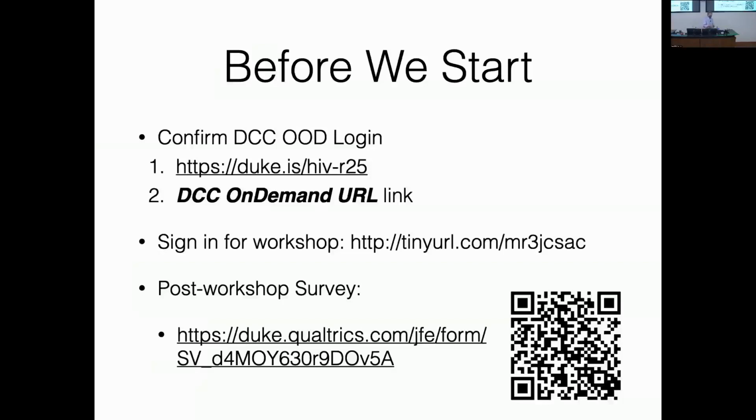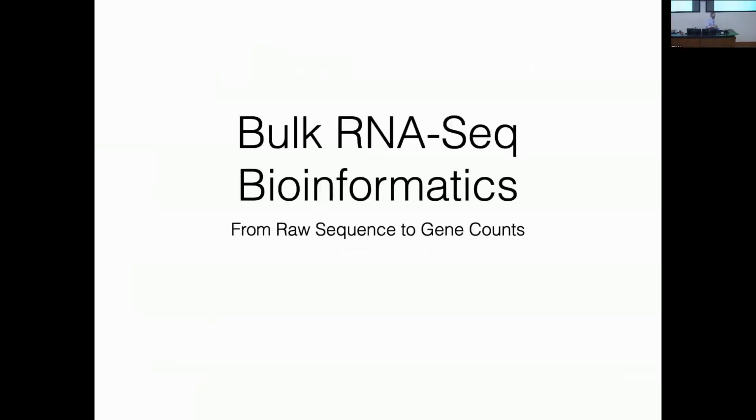Okay, so I'm here today to talk about bulk RNA-seq. If you're here to hear something else, then you're in the wrong place or at the wrong time. I'm going to give a little bit of background on the theory of how we do the analysis and what sort of questions one might ask with bulk RNA-seq.